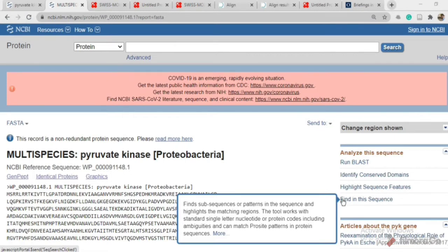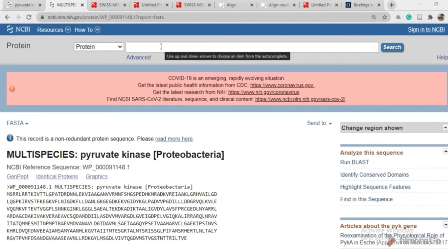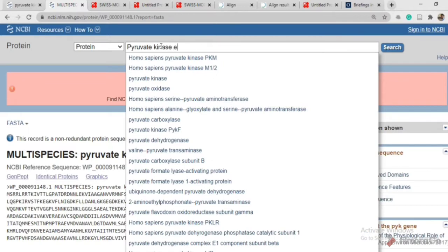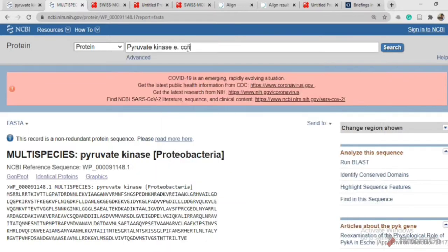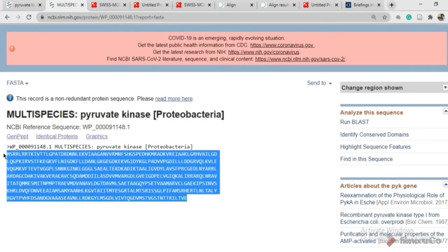First of all we need a protein sequence to build a model. As discussed in our last video about how to get a protein sequence from NCBI, I recommend you watch that first. To get a protein sequence, open NCBI and put your input as a protein name followed by its organism. I will search pyruvate kinase along with its organism name, and search. You will get a FASTA sequence of your protein.